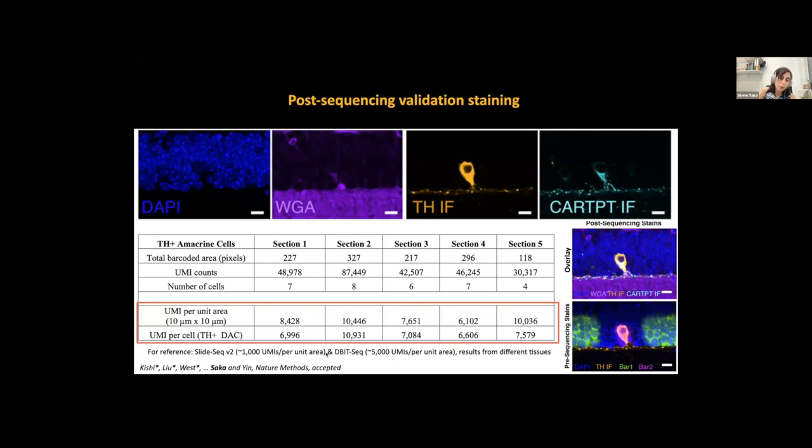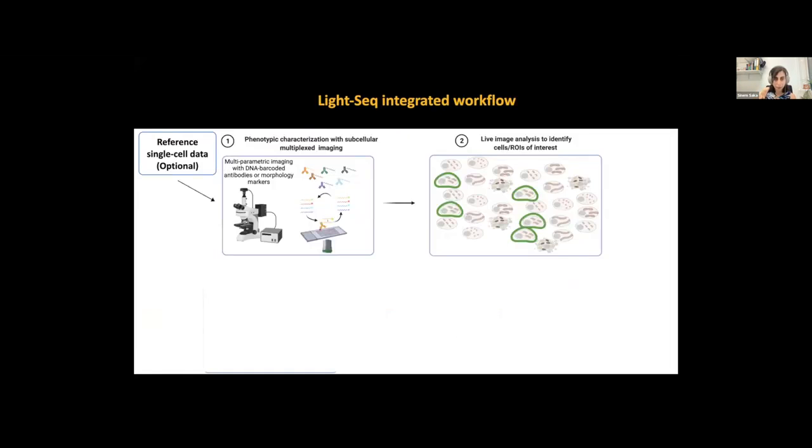And we are on par with some of these other approaches, both commercially available or other developed approaches for spatial omics, which have also been getting results around 1,000 to 5,000 per this type of unit area. These results are quite variable because the tissue preparations or tissue types really affect them. But we think this is great that we are on par with other approaches, or even better in terms of our recovery from the same sample without dissociation.